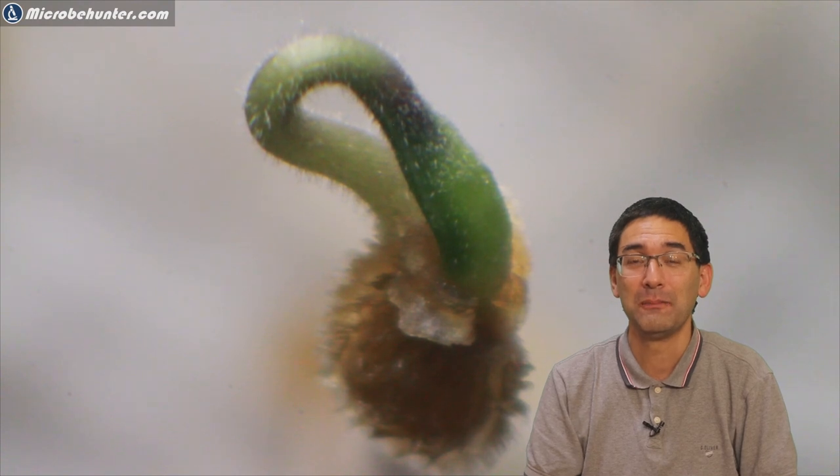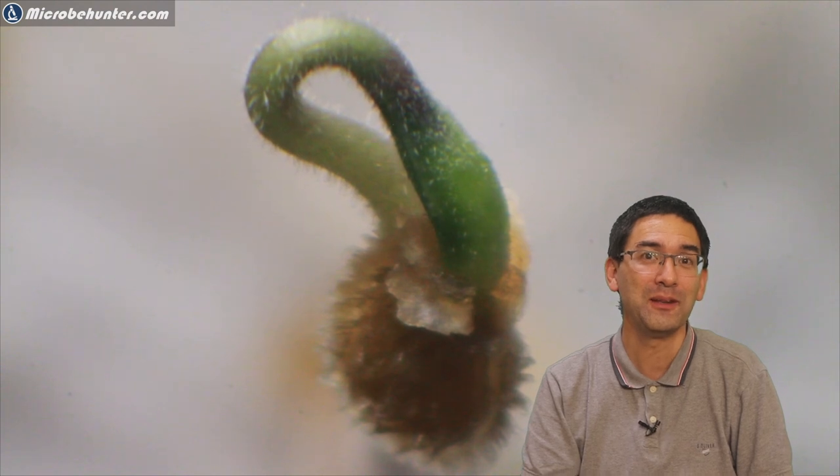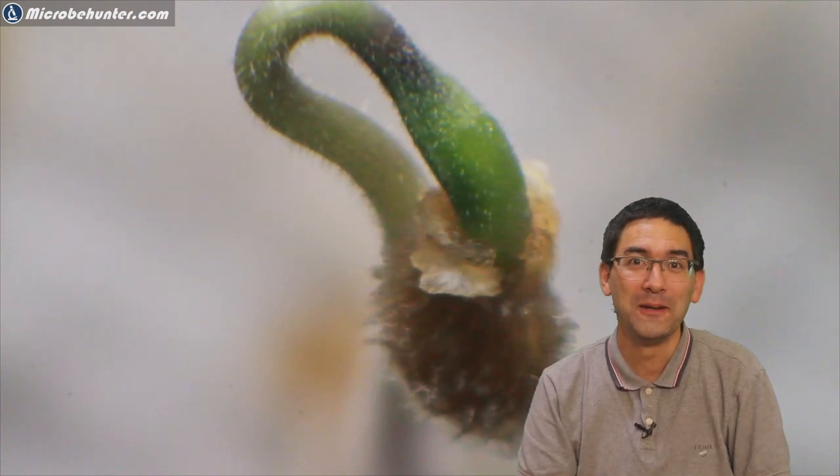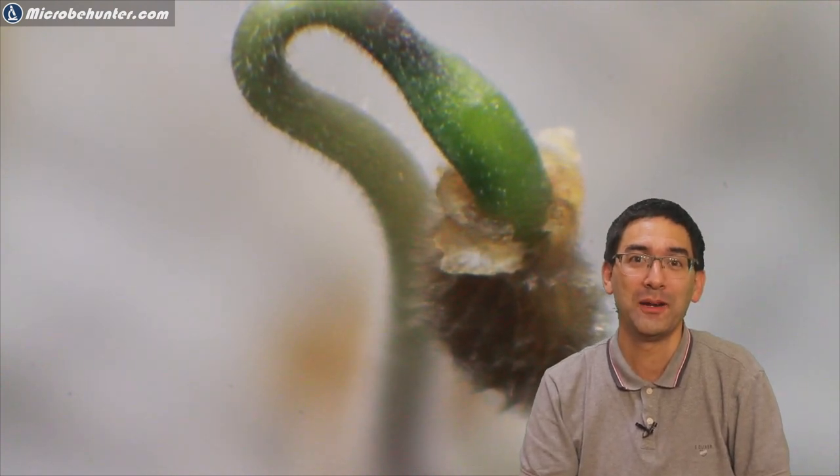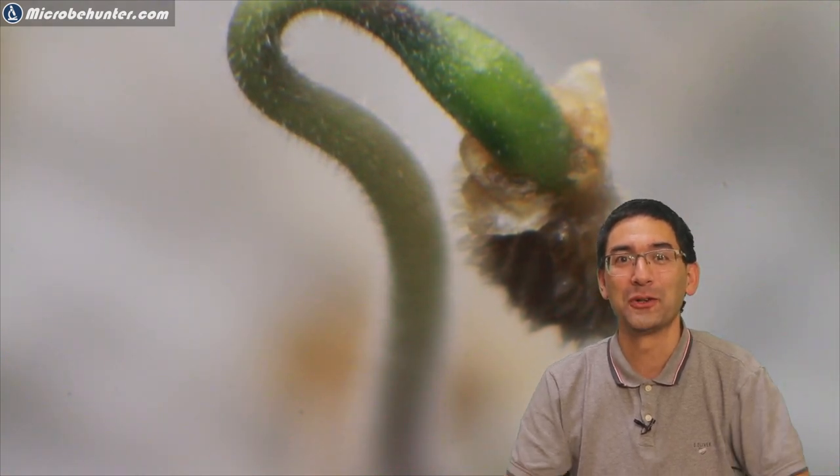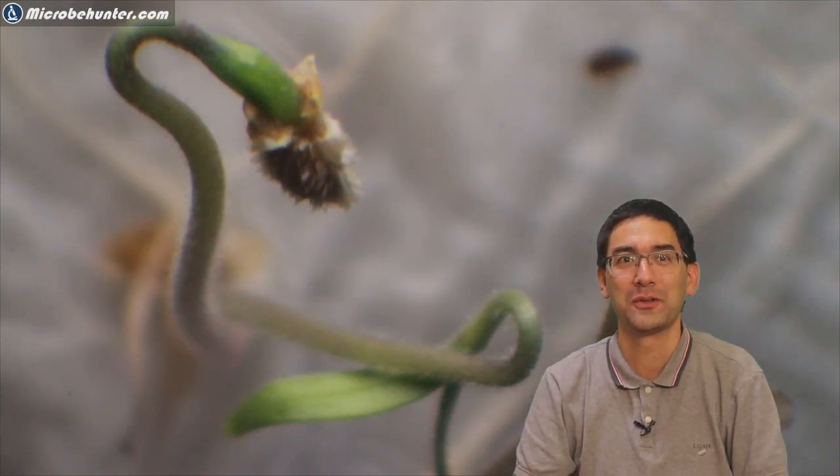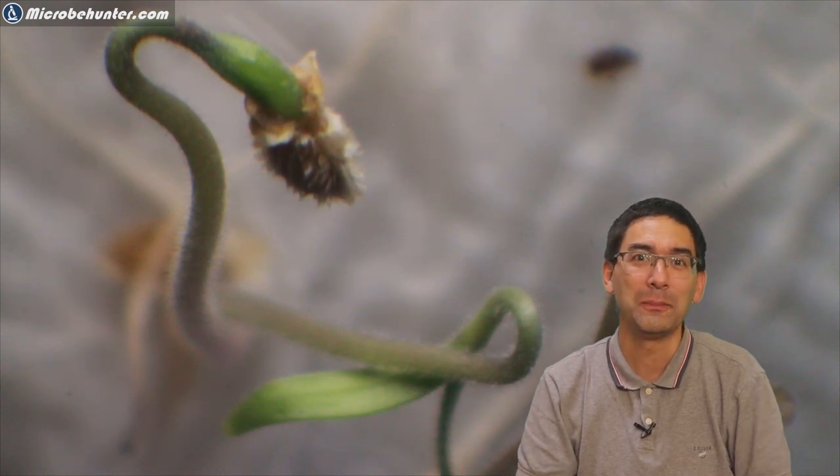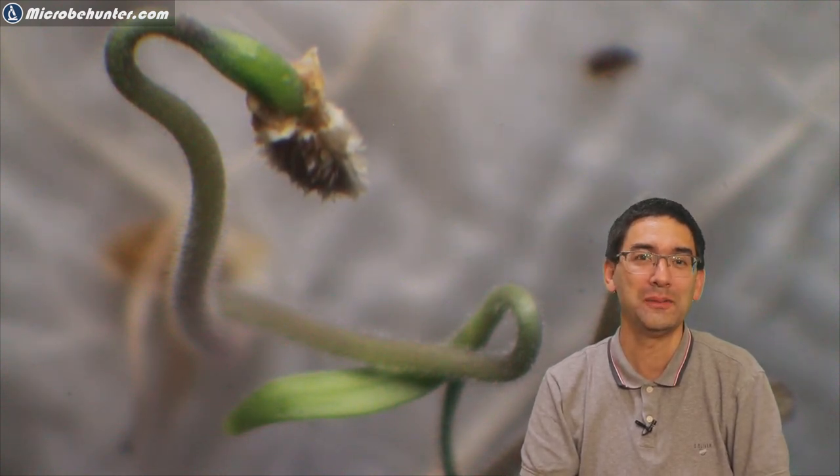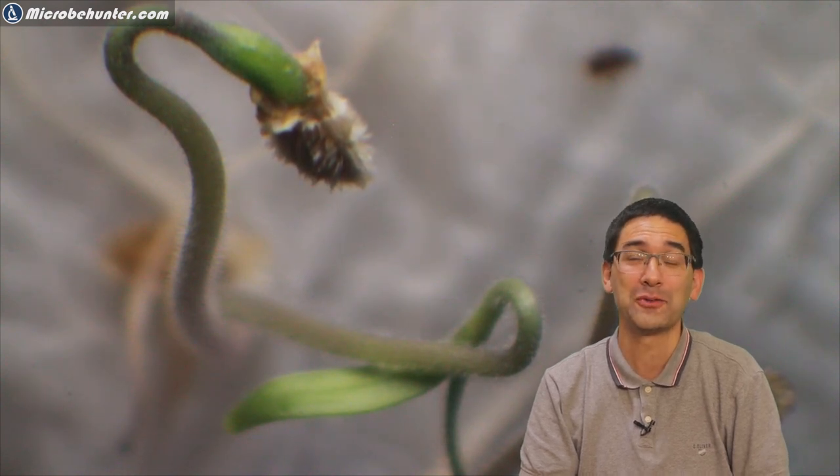I also had to try the same thing with a slightly more grown plant. Here too I waited a little bit, and after a couple of minutes I could observe that the plant actually started to grow upward and grow towards the light. There are plenty of things that you can observe and plenty of seeds that you can put under the microscope.